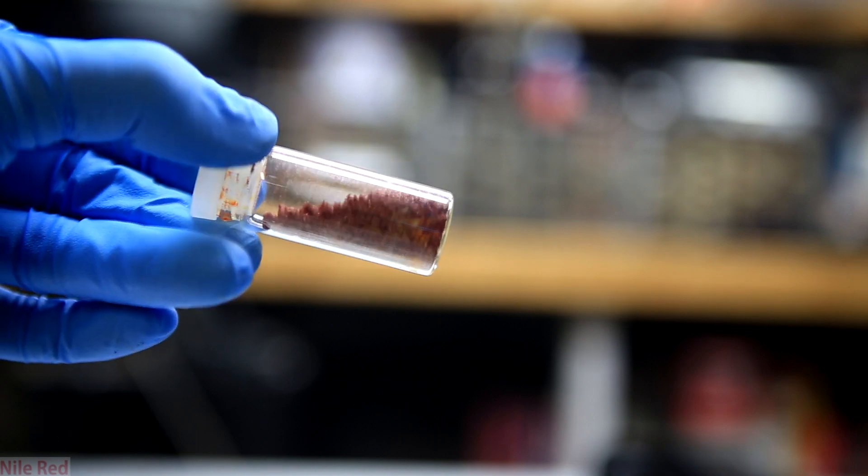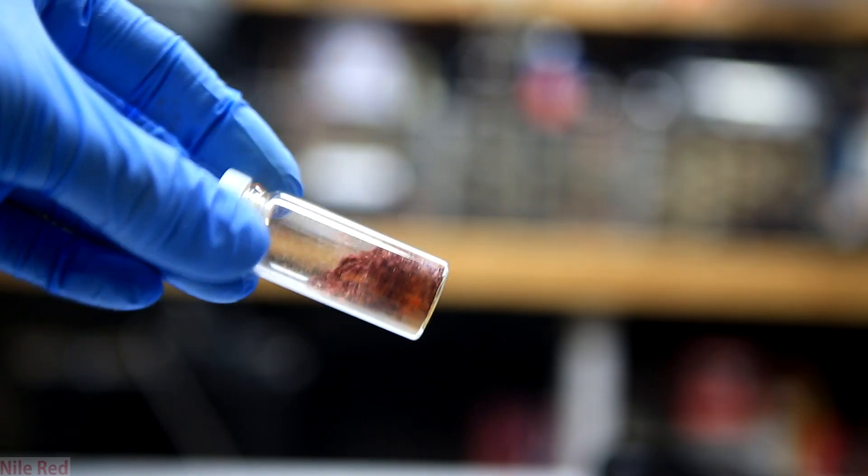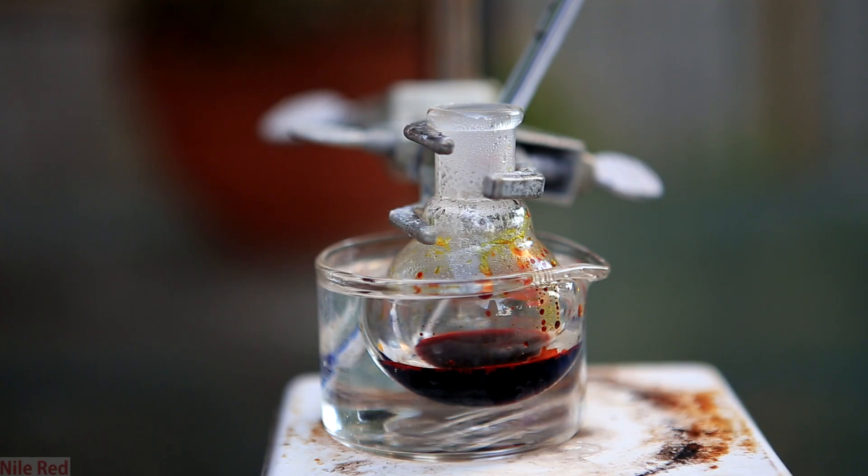Fluorescein is a pretty interesting molecule with quite a wide variety of uses because it's quite fluorescent but has a very low toxicity. In particular, this low toxicity allows it to be used for everyday things as well as in the medical field for diagnostics. I actually find it pretty interesting that the toxicity is low enough that it can be injected into people to help map the vascular system and diagnose diseases.